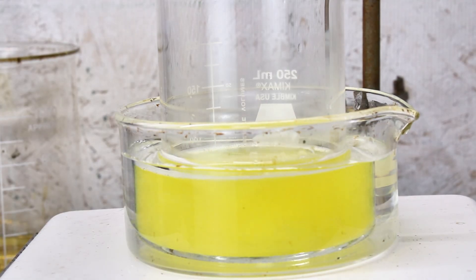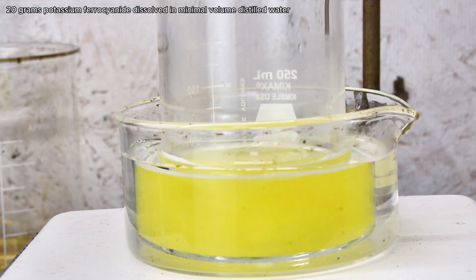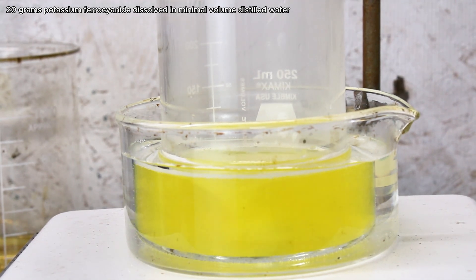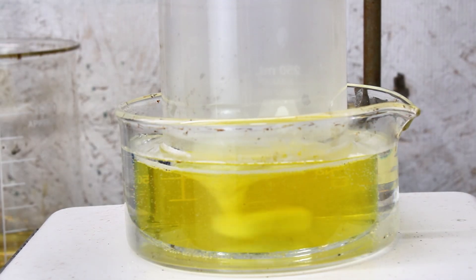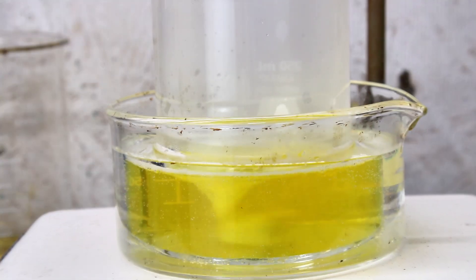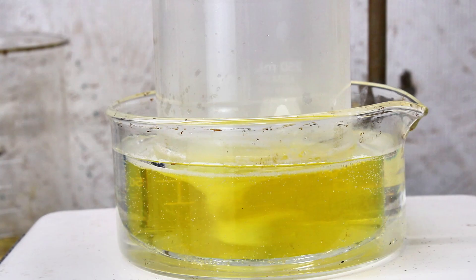To make sodium nitroprusside, I begin by dissolving 20 grams of potassium ferocyanide in 30 milliliters of water. This was taking a while to dissolve, so I went ahead and placed the beaker in a hot water bath and heated it to 90 degrees Celsius with constant stirring until all the ferocyanide had dissolved and the solution was a clear yellow color.